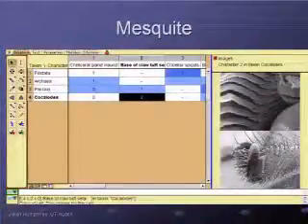And that matrix will have ultimately a code, a 0 or 1, that corresponds to some state of some feature, okay? And so in this particular case, we're looking at some small critter that I'm not sure what it is, and has decided that there are two states of that, okay? And in this particular case, has documented them.